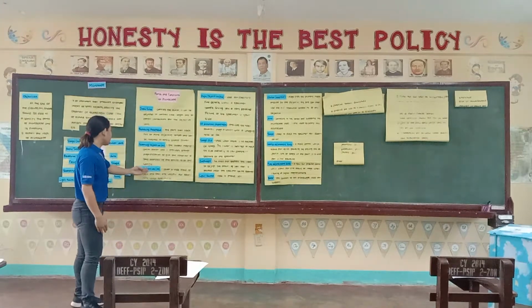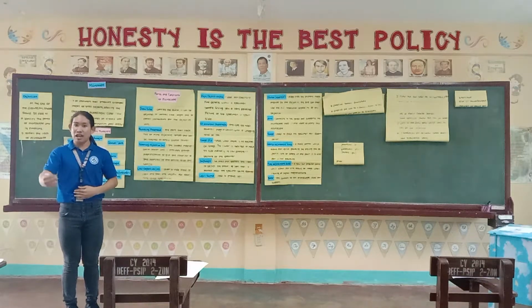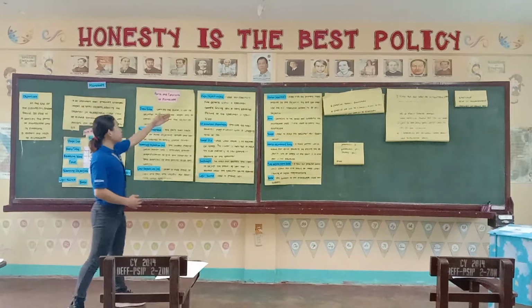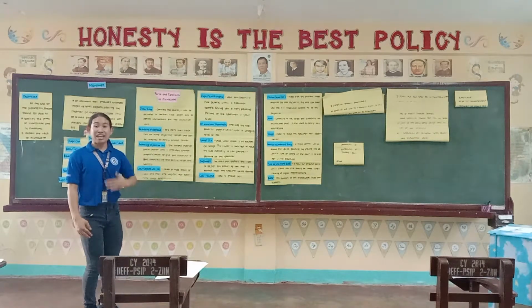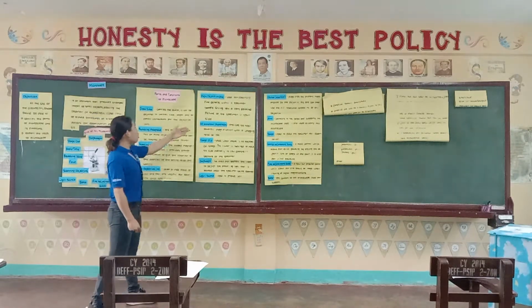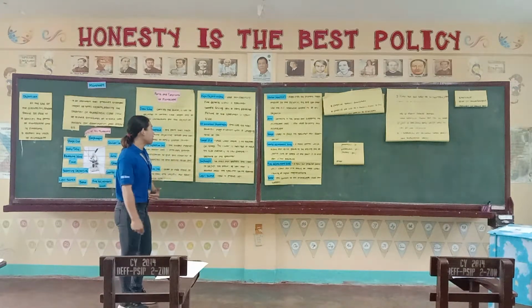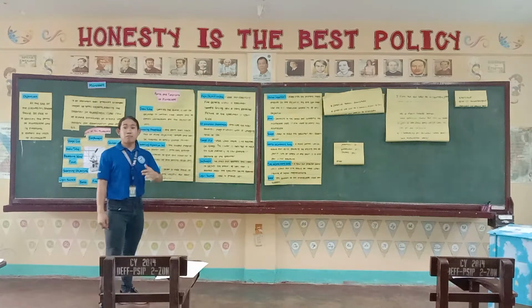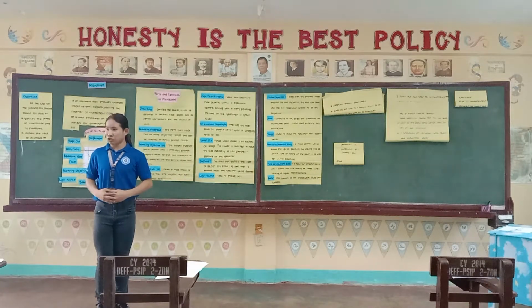Right? So, meaning ang low objective has a wide field of structure, wide field ang iyang magnification. At the same time, the high objective is ideal for observing the fine detail of a structure. And also, the oil immersion objective has 100 times power magnification, in which it is the most powerful magnification tool in observing the structure of a cell.